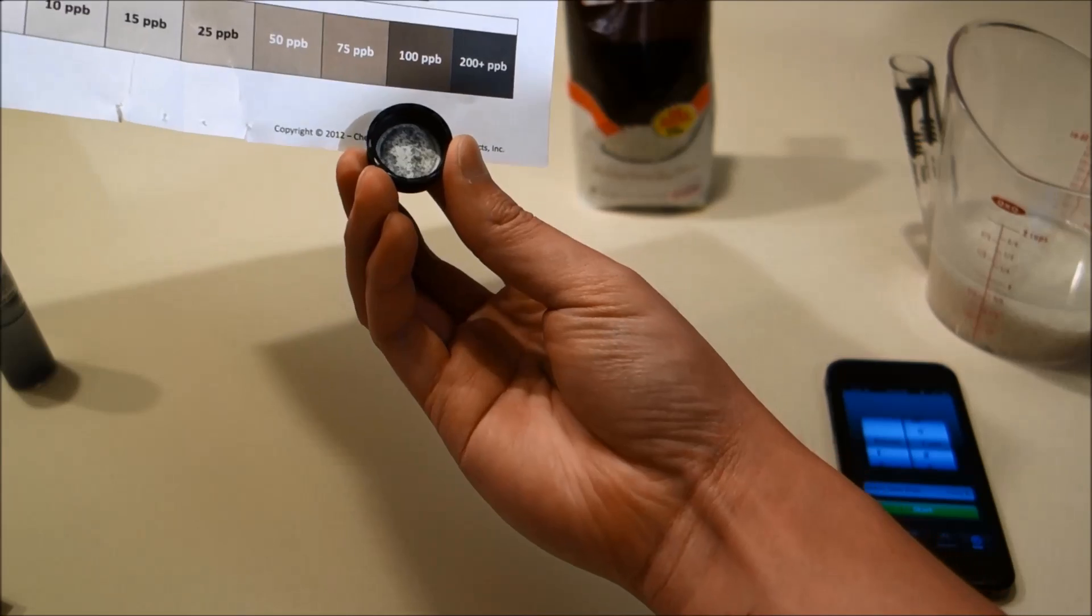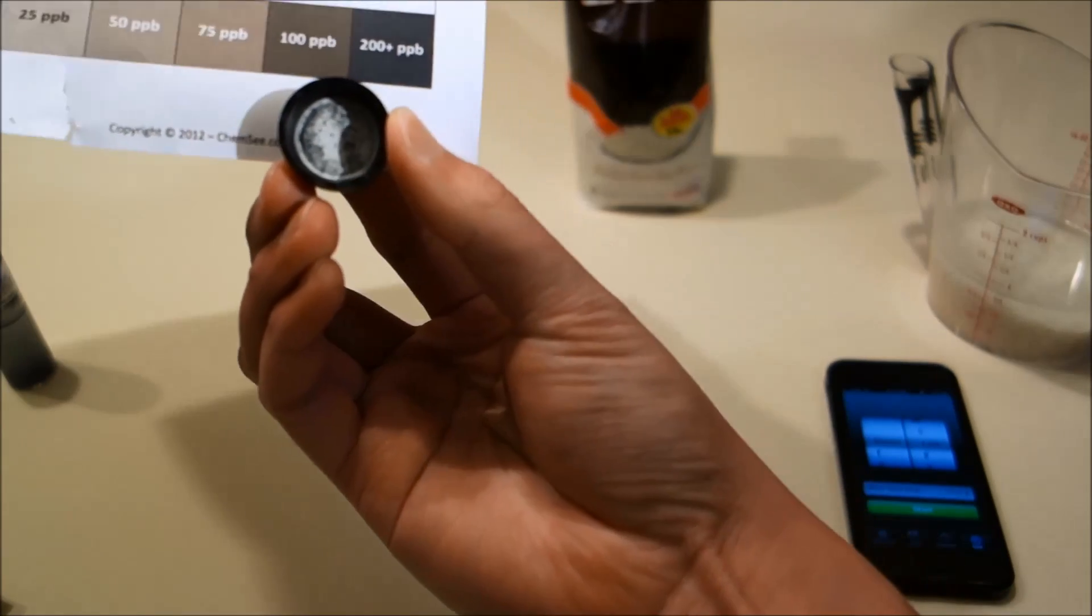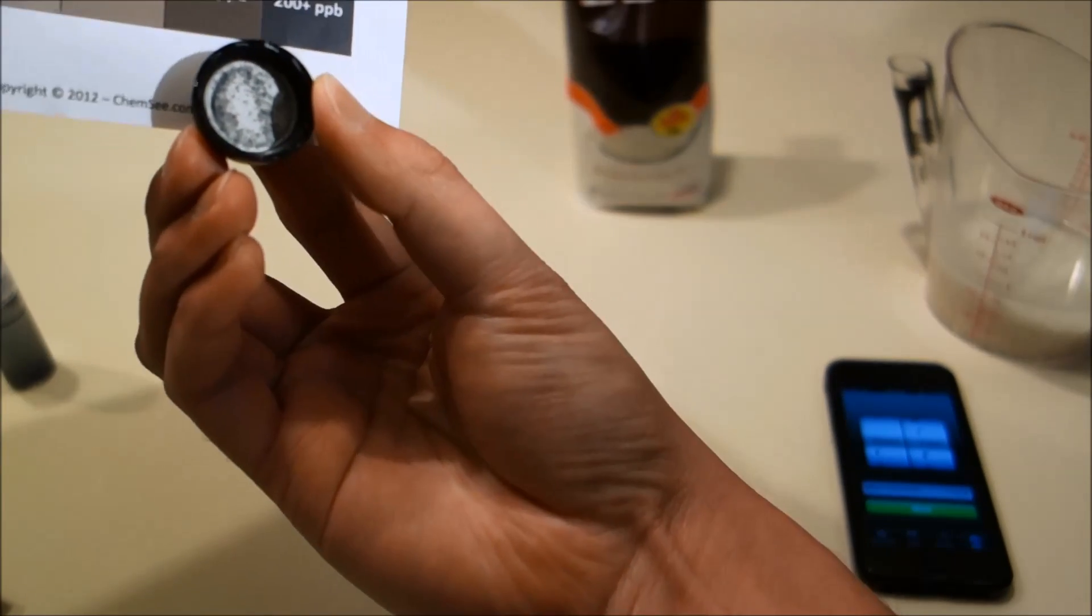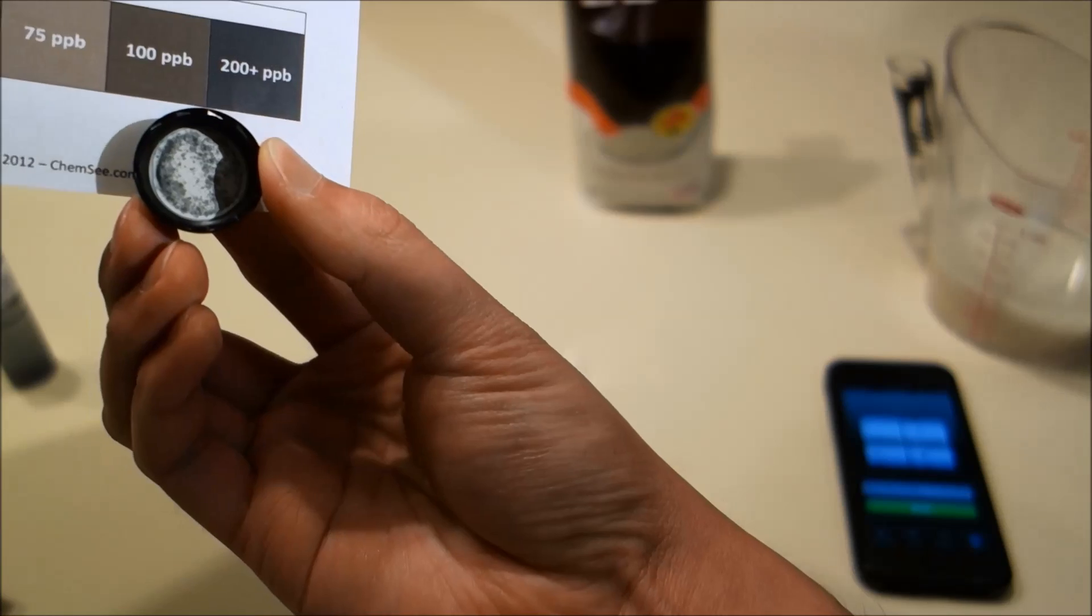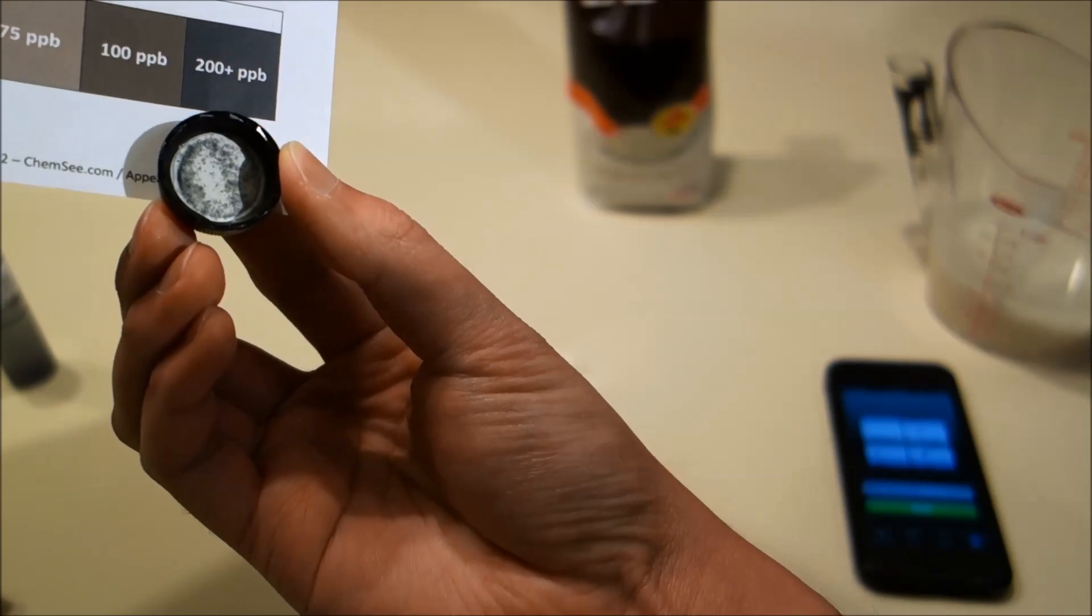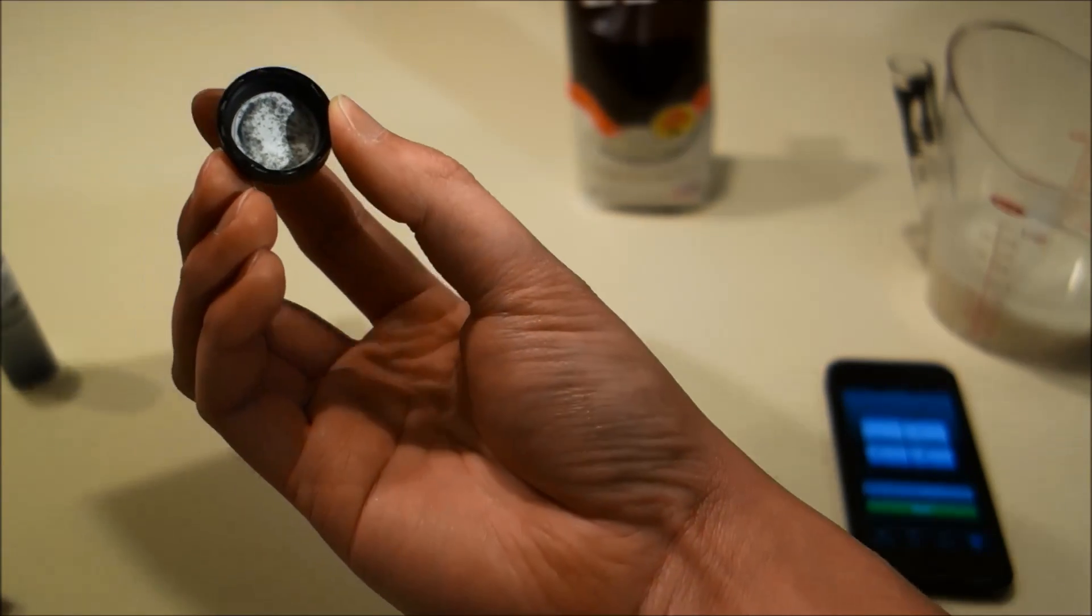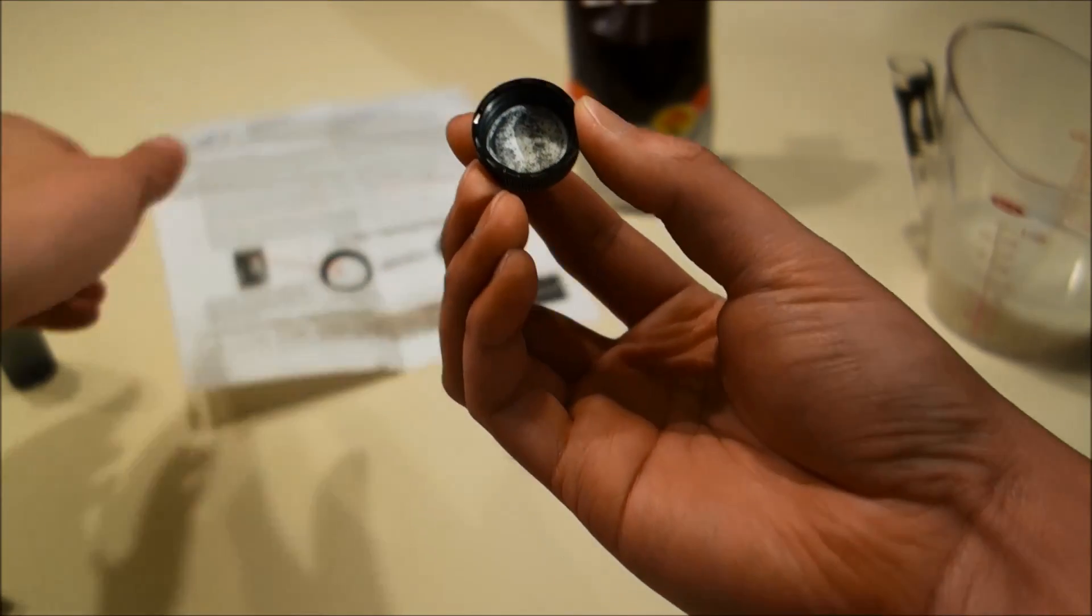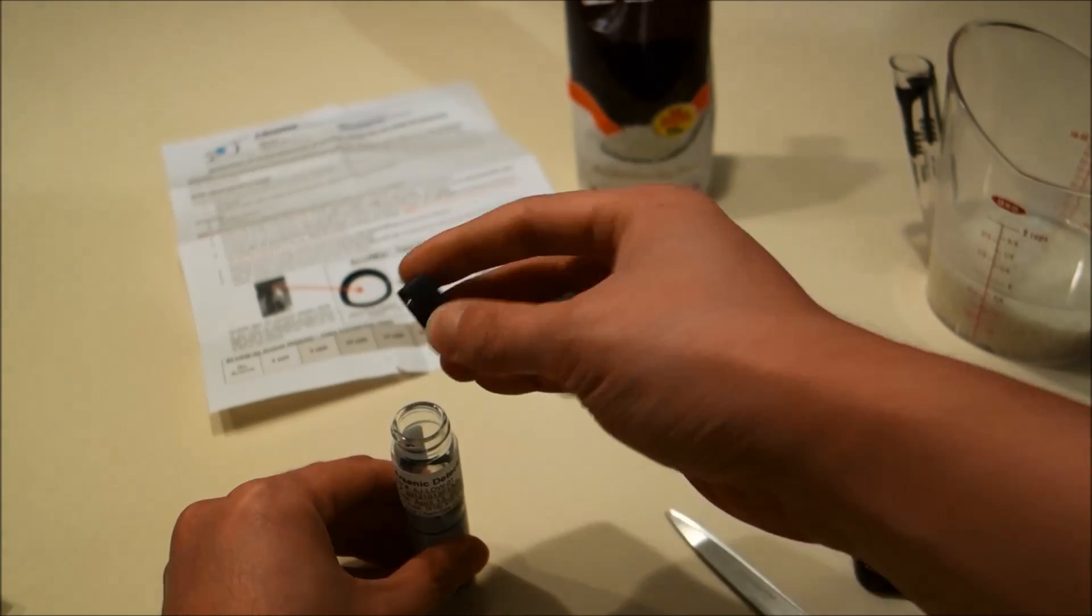Now, as you can see, the color in the cap is quite dark, suggesting there is a high amount of arsenic in our sample of American white long grain rice.